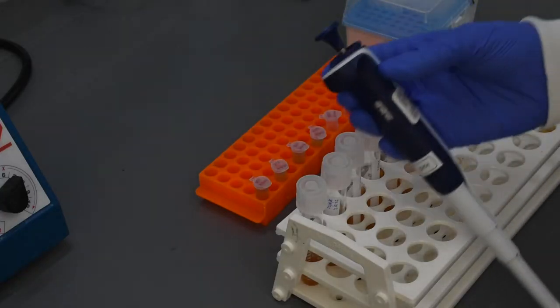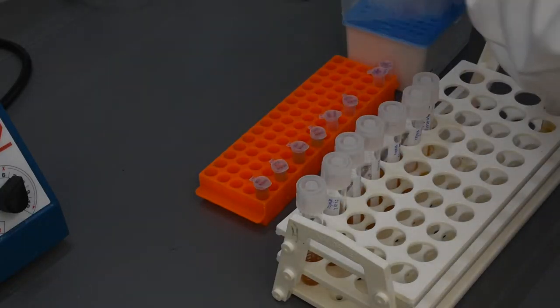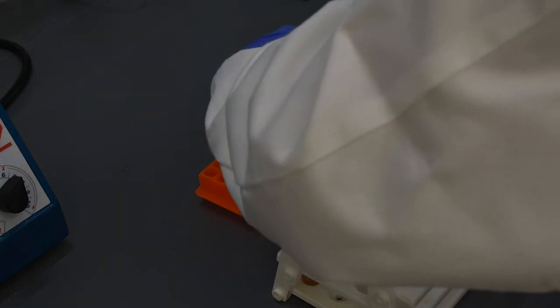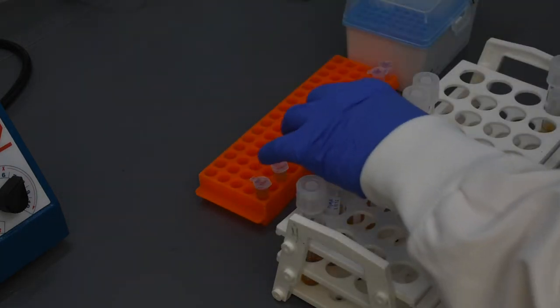After 2 days of growth, your culture broth will appear turbid with cells. Transfer 1.5 ml of broth to 1.5 ml microcentrifuge tubes labeled appropriately.